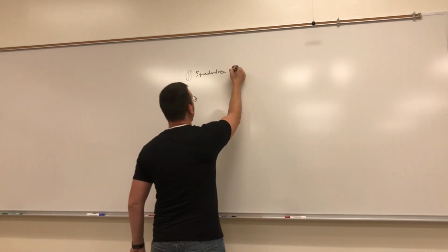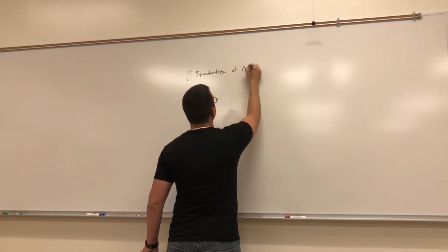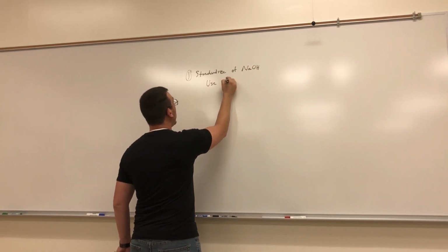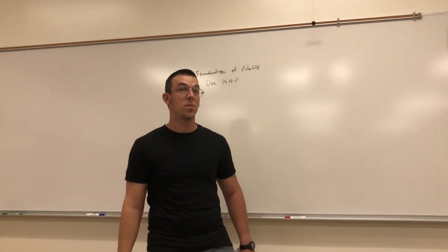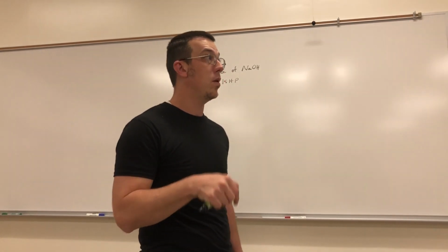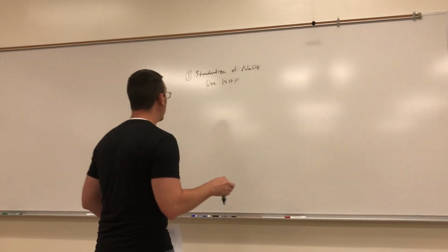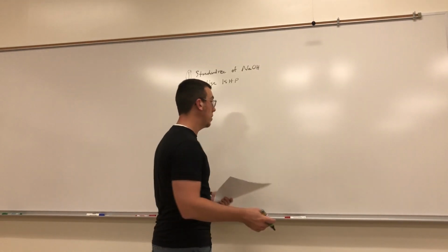Okay, so then standardize sodium hydroxide. Now what we're going to use is KHP. KHP is not potassium hydrogen phosphorus, but it's potassium hydrogen phthalate. I provided you the bottle on Moodle so you can see what the formula weight is and also the formula of that compound. So now what we're going to do here is this is an acid-base reaction.